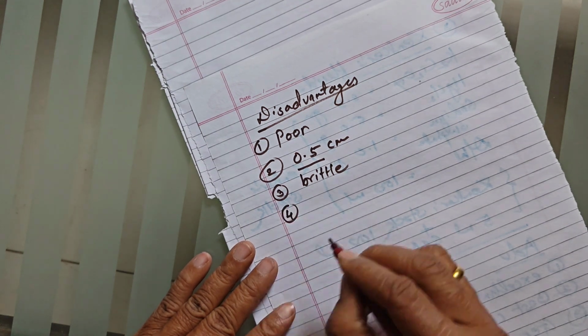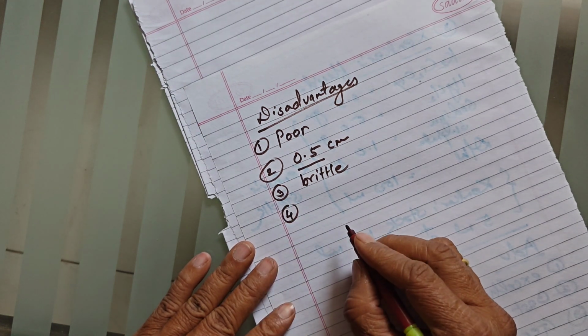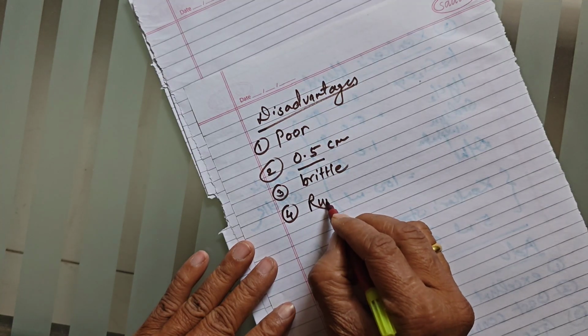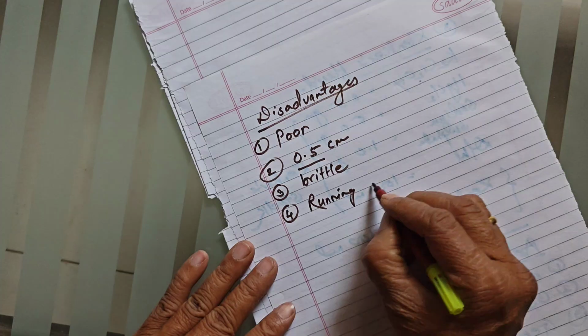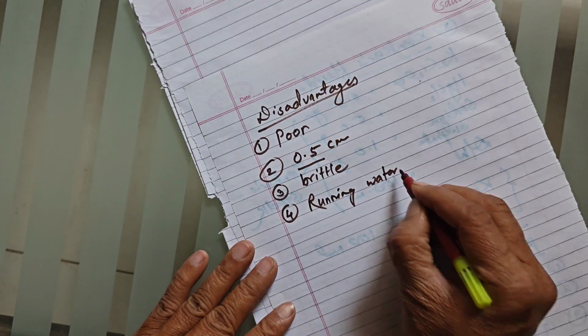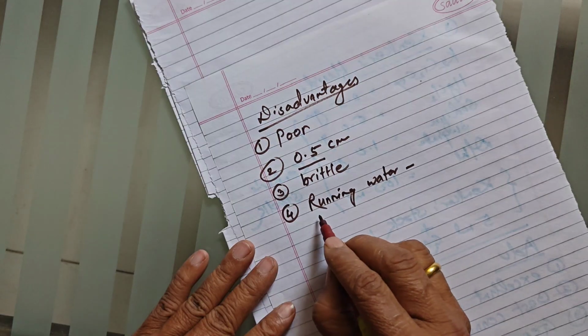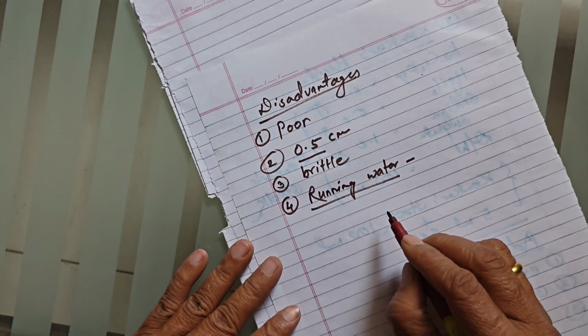The fourth disadvantage is that the tissue must be washed in running tap water for several hours to remove the fixative. That is, it is difficult to wash.